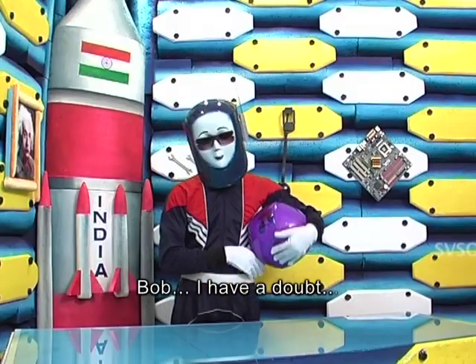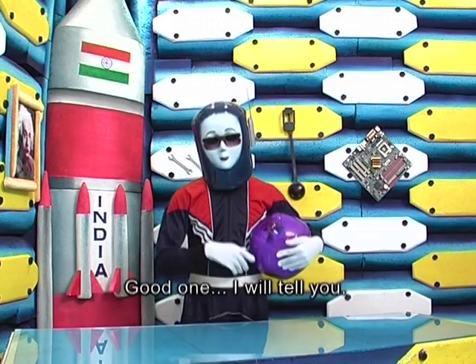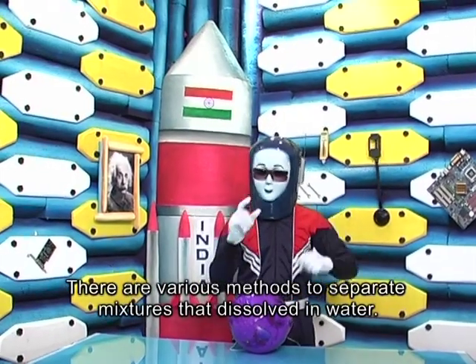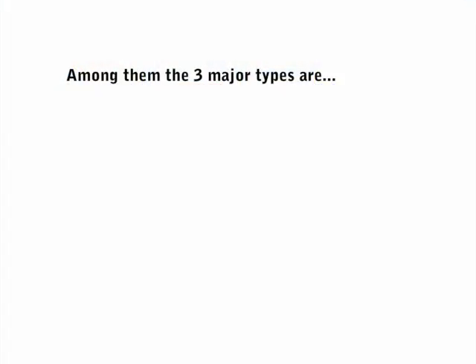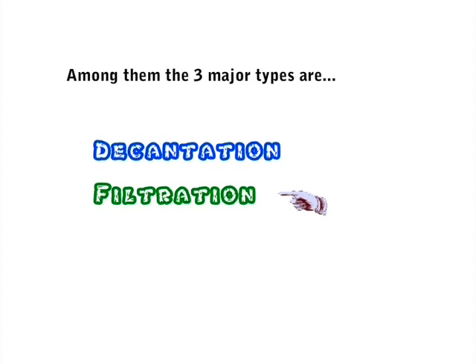Bob, I have a doubt. How can you separate different substances from water? Good one. I'll tell you. There are various methods to separate mixtures that are dissolved in water. Among them, the three major types are decantation, filtration, and evaporation.